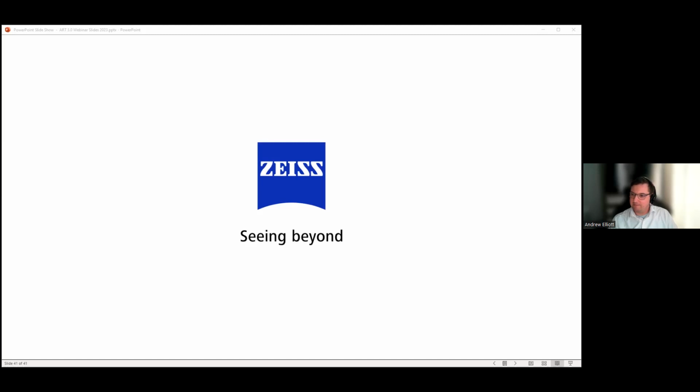Okay. Next question from Michael. What's the difference between X-ray microscopy and X-ray microtomography? So essentially the difference between those that I showed today is X-ray microtomography, or X-ray CT, I guess as it's called, is just using a single method of magnification, which is called geometric. So basically, if you want to improve the magnification, you have to move your sample closer to the CT source.